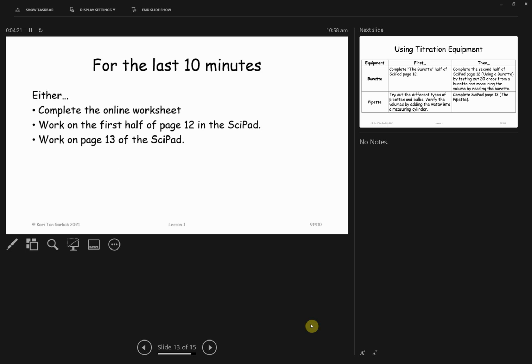Are we reading from the middle or is it? You're reading it in the opposite direction. You're thinking about a measuring cylinder. You're thinking about these guys because you're used to it. But you're measuring the water, you have to be mindful that the scale is in the opposite direction. Here, let me grab this for you.